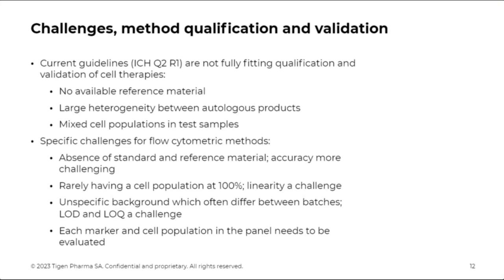And as I said, there is a large heterogeneity between autologous products. Like my T cells are not looking like my colleagues' T cells, for example. You have mixed cell populations in the test samples. And specifically for flow cytometry, I will go through them closer in the next slide. But the fact that we don't have any specific standards and reference material poses challenges in the accuracy determination.